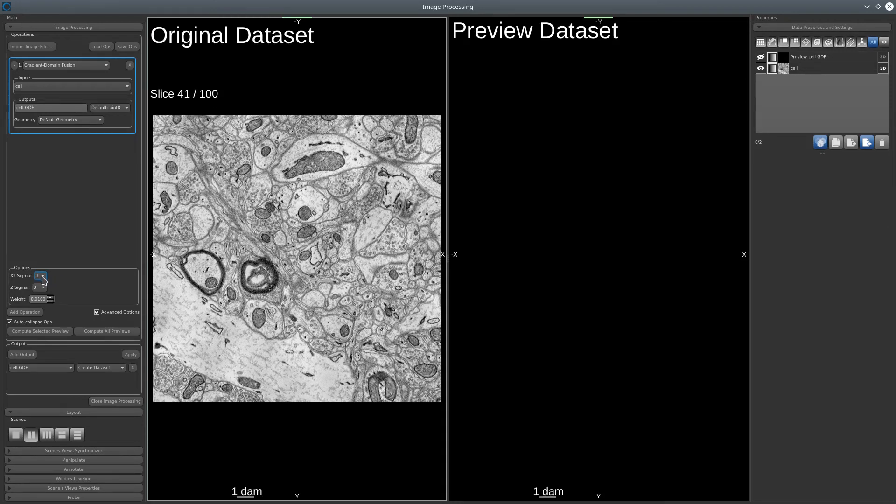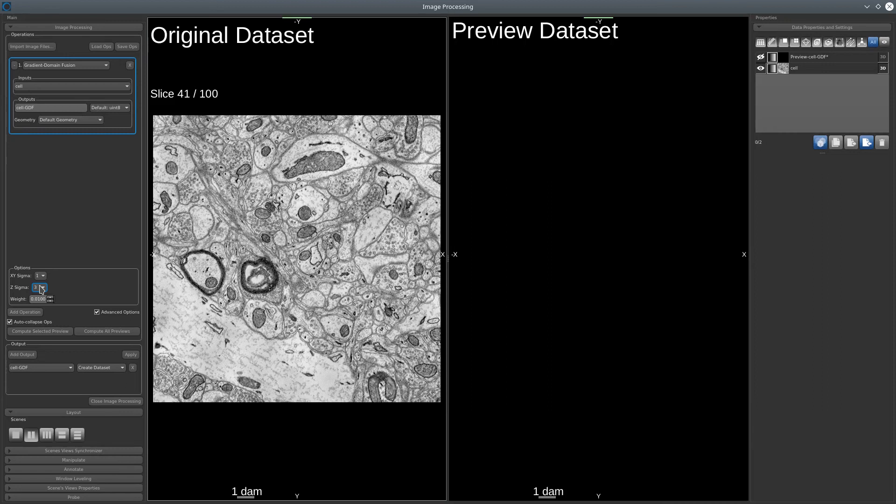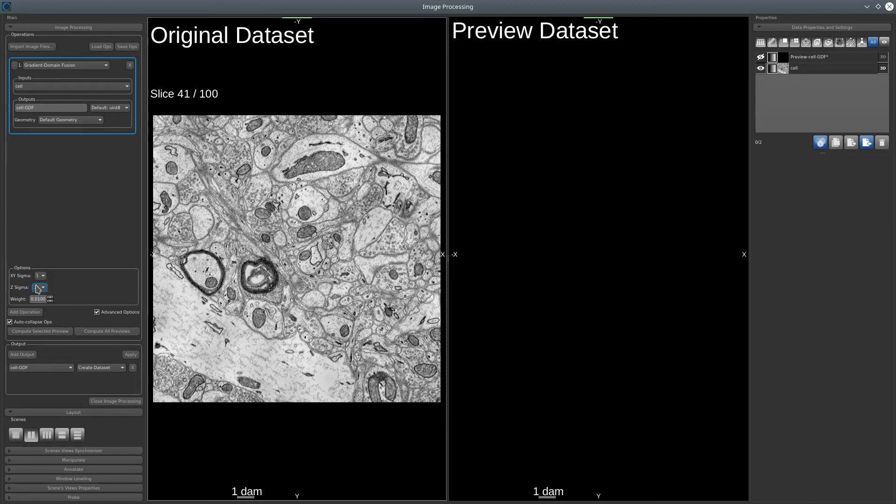Then we'll have to set the Z sigma. It's mandatory that this sigma is higher than the X, Y one. Since the artifact is in Z direction, what I mean by there is that for each slice, we have a different intensity. It's better to have a higher sigma in that case to make sure that the artifact will be correct.